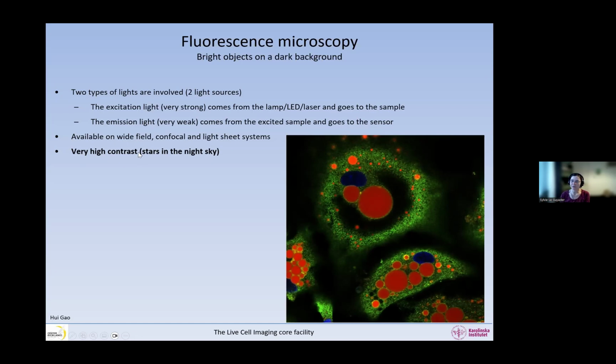Resolution is very important. Contrast is also super important. If you have no contrast, you can have as much resolution as you want. You will not be able to see anything. And that is something that we will talk a lot about in the next week and even tomorrow.